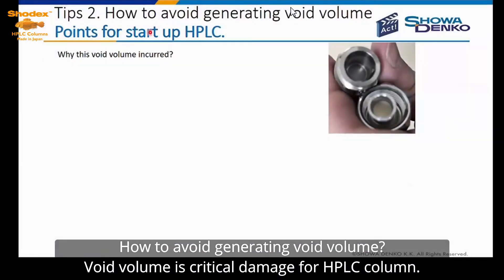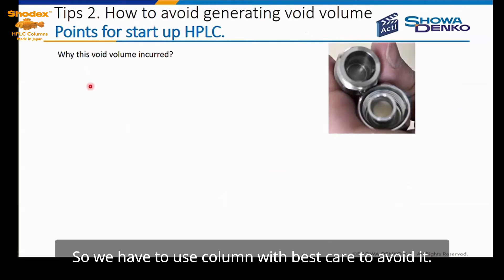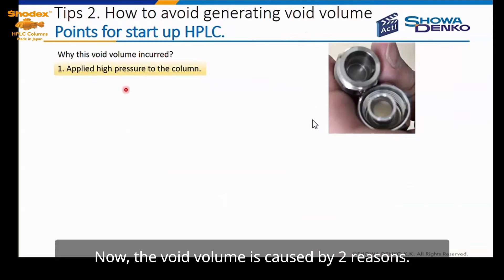How to avoid generating void volume? Void volume is critical damage for an HPLC column, so we have to use the column with care to avoid it. The void volume issue: void volume is caused by two reasons.